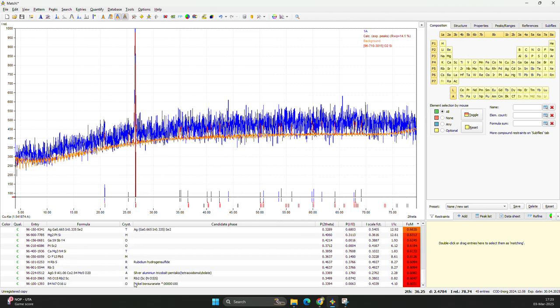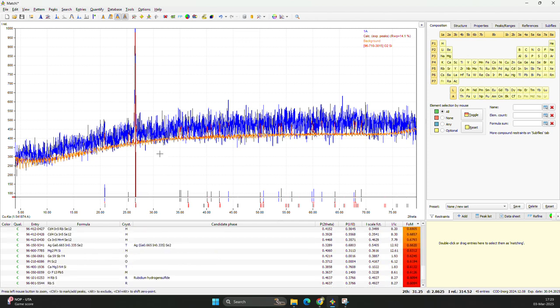rich. When using this software you mostly know the rock name, because for example with a limestone XRD analysis, the most abundant mineral will be calcium carbonate. So for example, I know that this is a quartzite sample, and in quartzite it's mostly quartz, silica and oxygen.